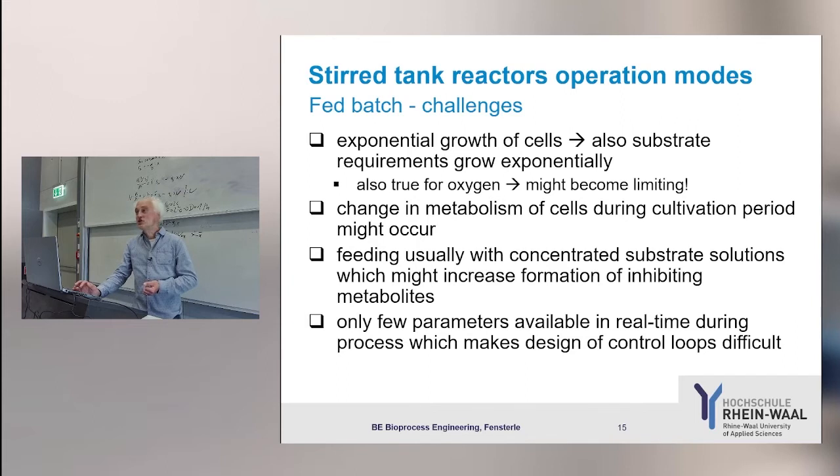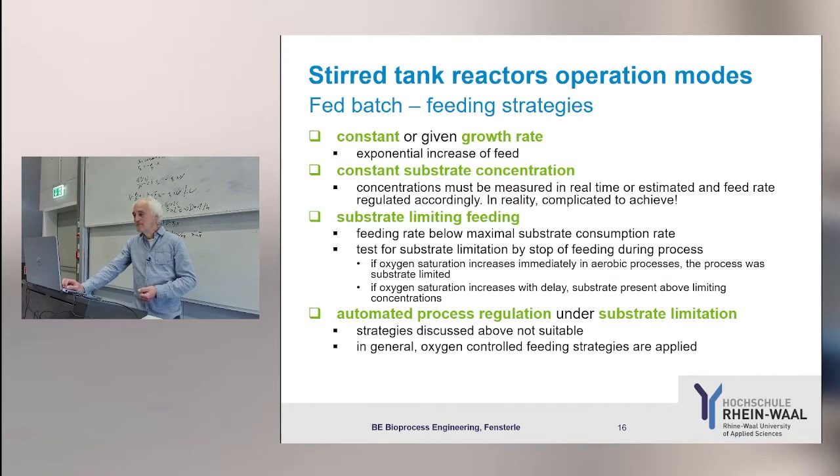develop a cheap Raman sensor for our bioreactor. The solutions for these Raman spectroscopes for bioreactors are in the range of 150,000 euros. This is too expensive. Yeah? But if you have that, you can measure substrate concentration in real time. This is cool. Yeah? Okay.